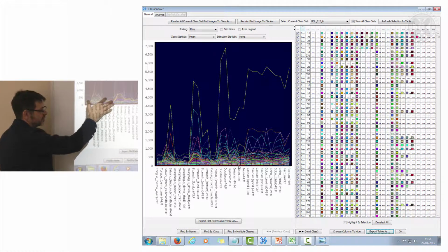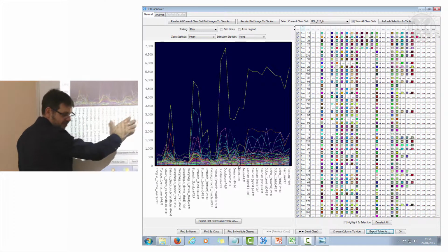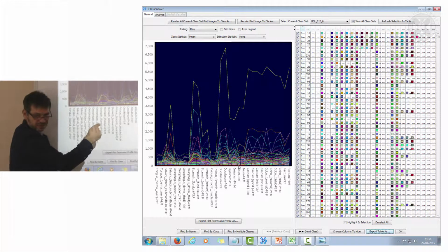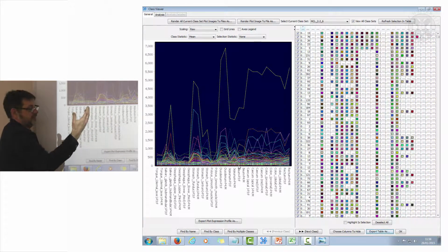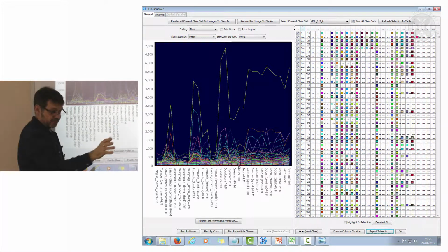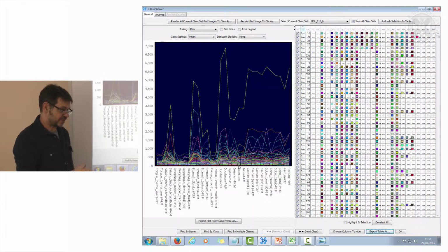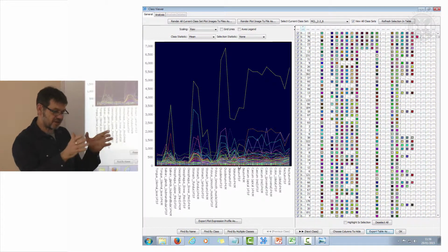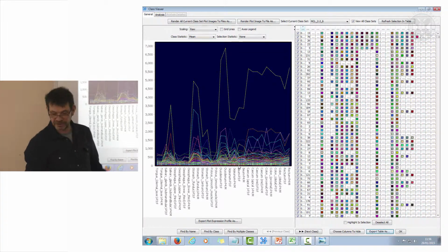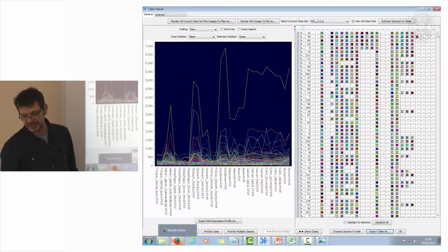The thing I like about this tool is I can actually see my data. I can see where the replicates are and I can use those replicates to plot. So even if only 2 of them worked, I know that there's a duff replicate in there. It didn't work, that replicate. I know that, and I understand the 2 on the other side work beautifully and replicated, and I can possibly consider saying I only ran 2 replicates because I know one of them didn't work. So it's very useful to look at that raw data and to understand how replicates are working and to look at that primary data. As I said, you can do a lot of things within here.